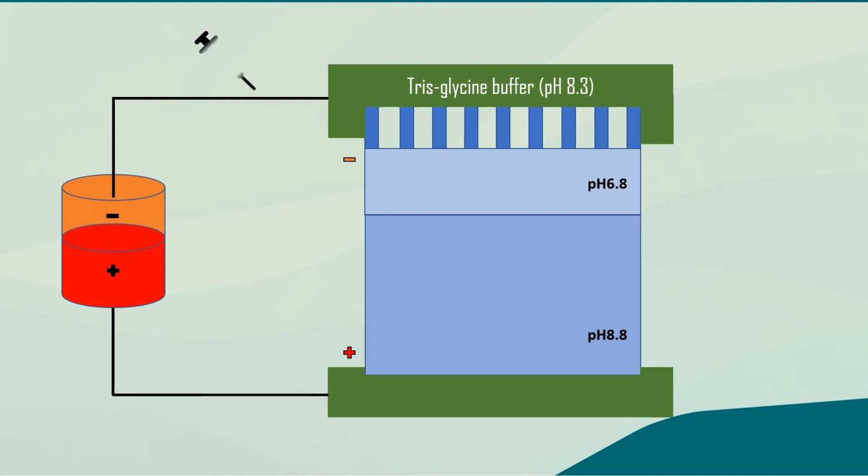Using a pipette, samples and a protein ladder are loaded into the wells of this gel. To visualize the sample run on the gel, the protein samples are premixed with bromophenol blue dye. The Tris-glycine buffer provides glycine and chloride ions, which helps to concentrate proteins of different sizes into a compact horizontal zone inside the stacking gel, so that they enter the resolving gel at exactly the same time.